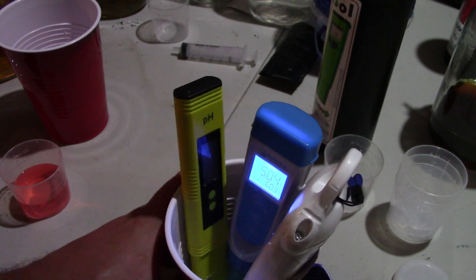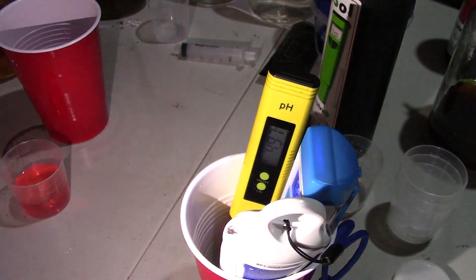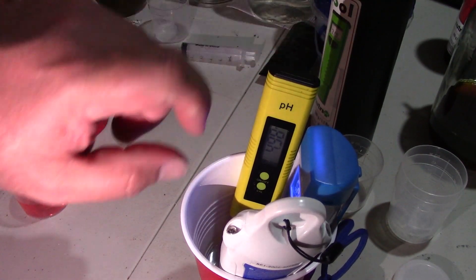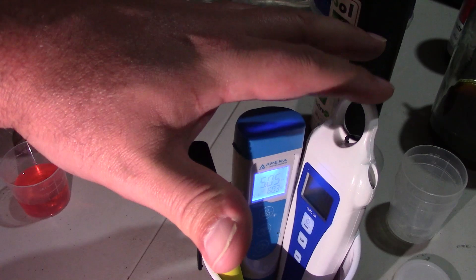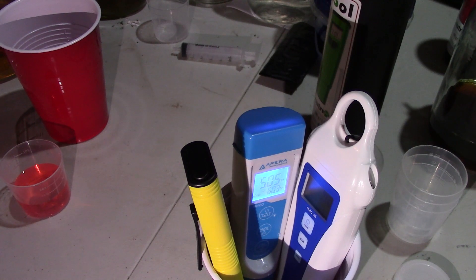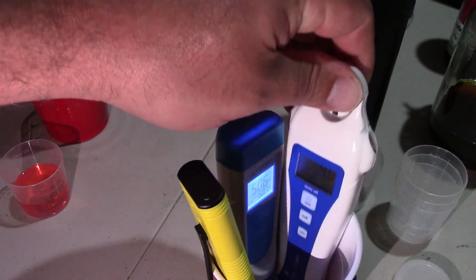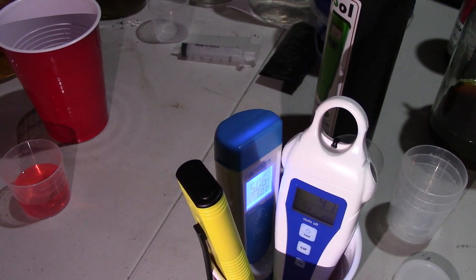4.97, 5.04, and 4.8 on this one. Can you guys all see that? I hope you can. 4.8 on that one, 5.04 on that one, and I'm going to bring it up — 4.97 on that one. $23 pen, $123 pen, and $140 pen. Wow, that comparison's pretty crazy. From the one decimal, for being the most expensive pen, I think that is a loser right off the hop. At one decimal point, not enough.